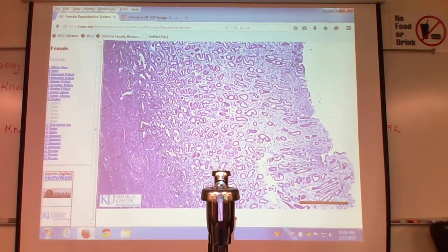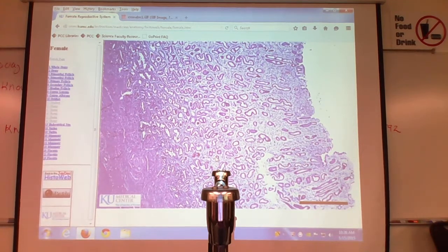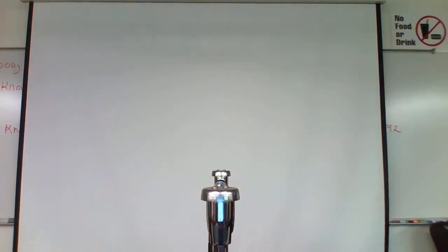After my uterus are my uterine tubes, fallopian tubes. What's the outside of the uterus? This is serosa. Hold on, let me find the page. 23 in the middle. Oh, that'd be on the very, very outside, yes. You can't see it on the slides, it's on the very, very outside of your stomach, right?